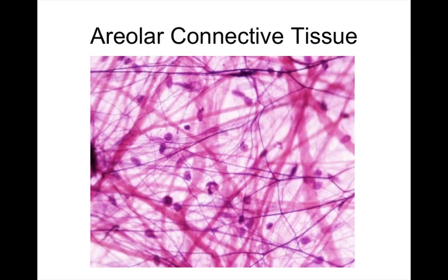Regular elastic connective tissue, we'll see a little bit later. So, areolar connective tissue, what's really distinctive about it are all those voids. And it's funny how you can see the fibroblast nuclei but not the outline of the fibroblasts. I don't know why that is. I think it probably has to do with the kind of stain they use, but that's a very common appearance for these.